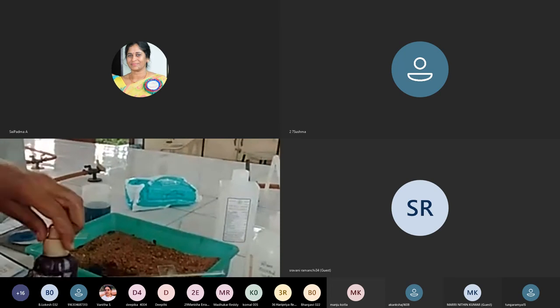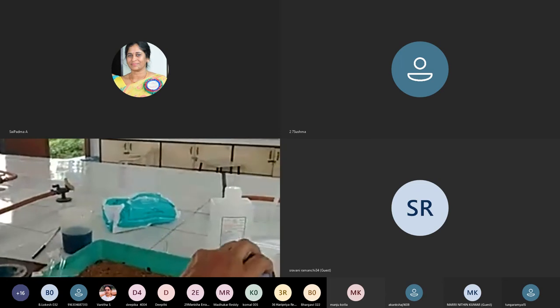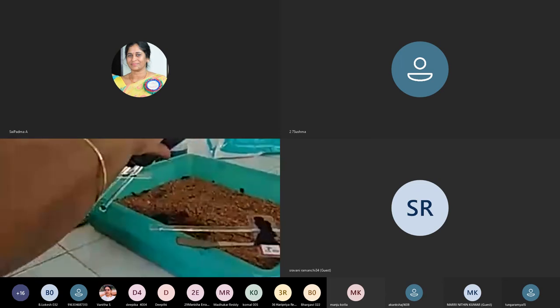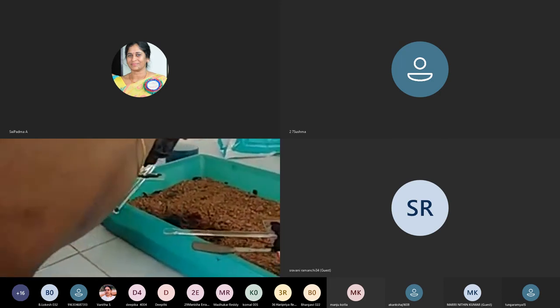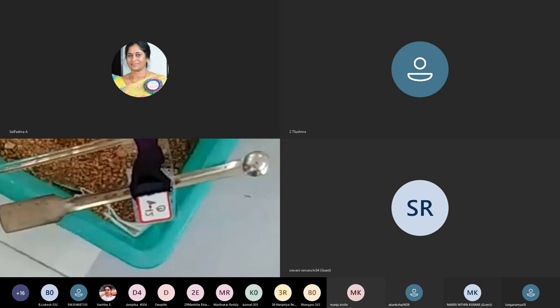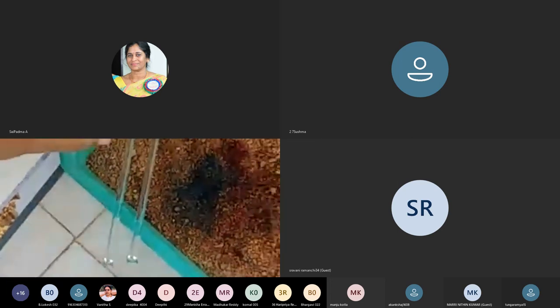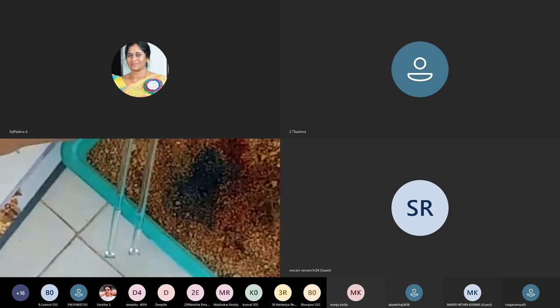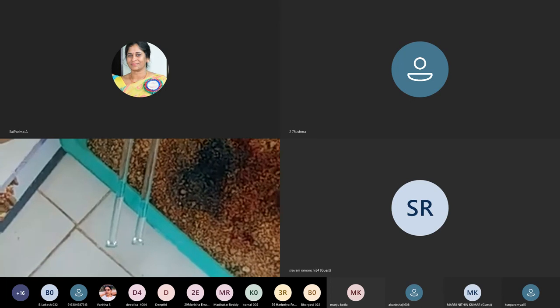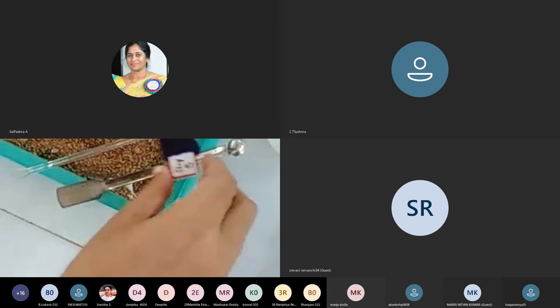This is crystal violet. So we have to flood it with crystal violet first. So just drop the crystal violet wherever we find the cultures. There we have made the smear. Heat fix the smear. We just add some drops of the crystal violet. And once we have added them, let us wait for 1 or 2 minutes. So just we have to see that it is spread evenly. The same thing we'll do to the other slide because the smear is present.